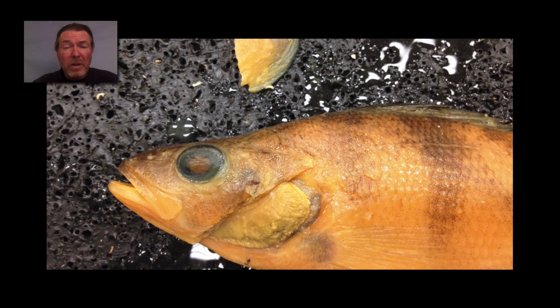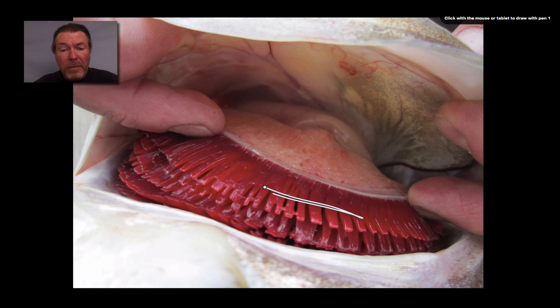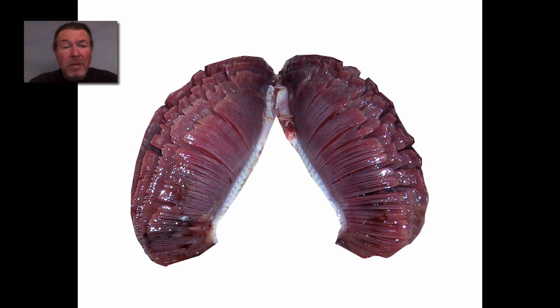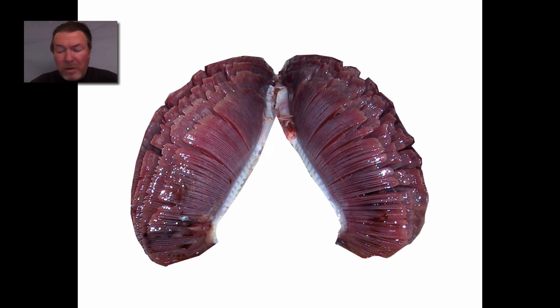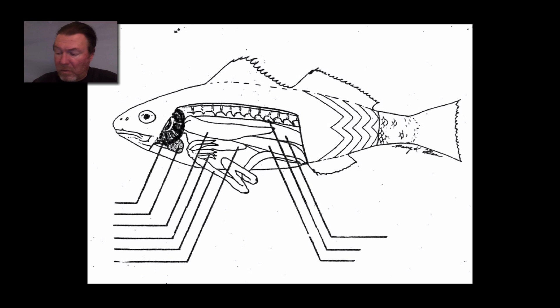The gills don't normally look that color as in the other video I showed you. This is a recently killed fish, and you can see the red color because there's a lot of blood that goes through the gills — they have to get the blood oxygenated. You can also see there's a lot of surface area on the gills. The more surface area you have, the more oxygen can be absorbed into the blood system and brought into the fish.